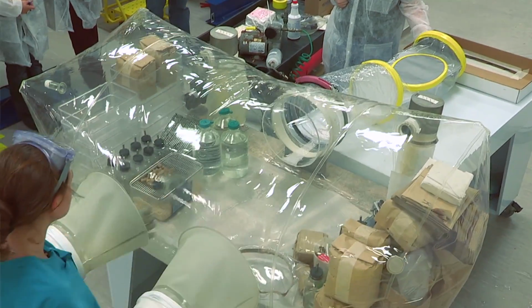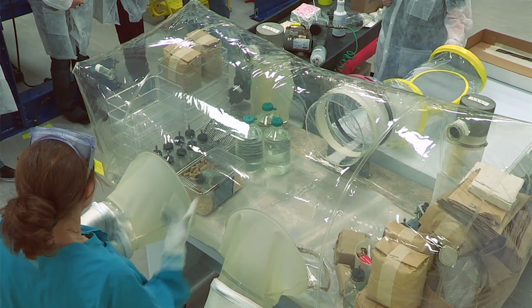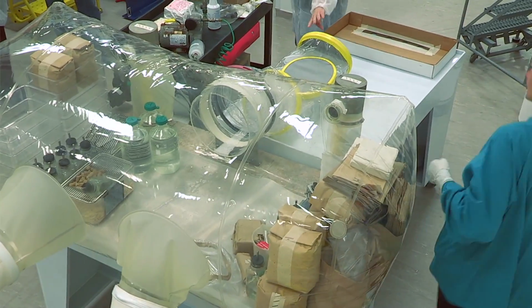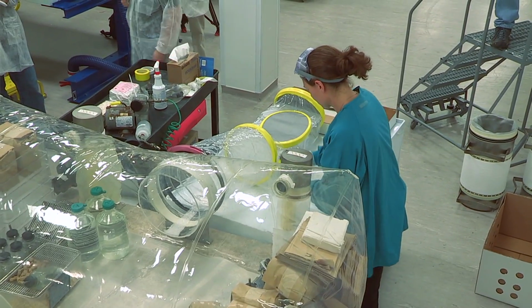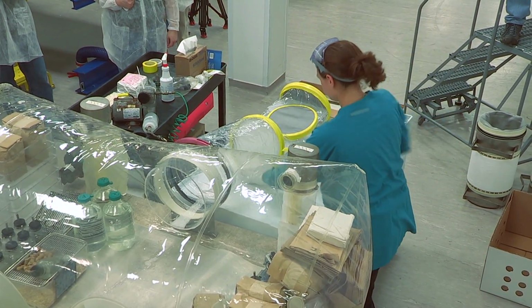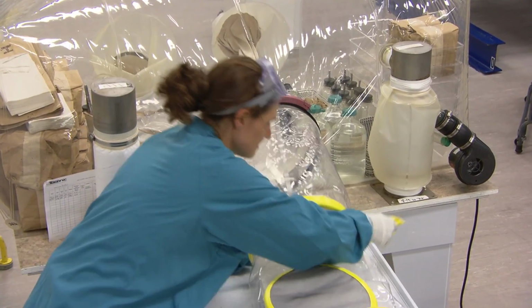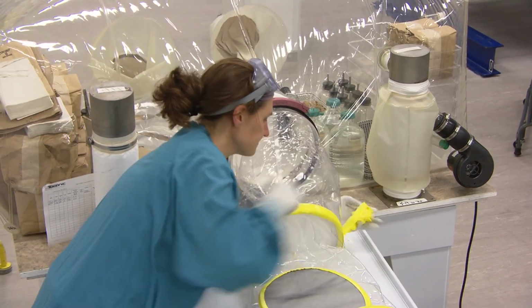And now for these, if you're going to pop the Mylar, then you could have someone push that up. Or if you want to untape, we could show you how to do that too. Just around and around, and this entire Mylar disc will be sent into the isolator.